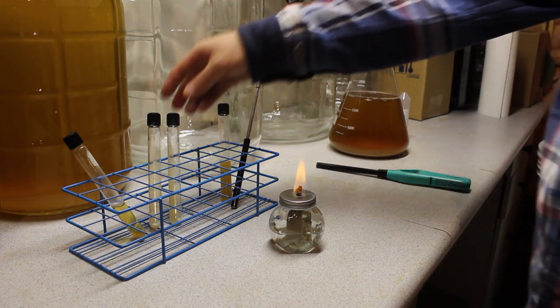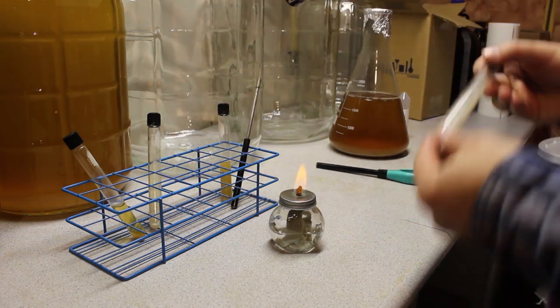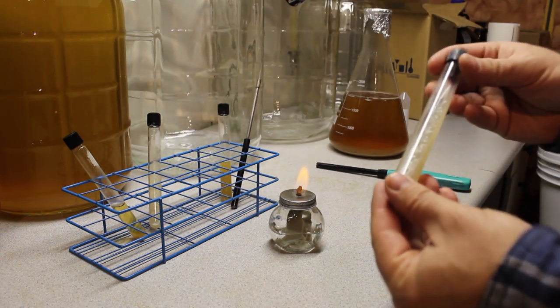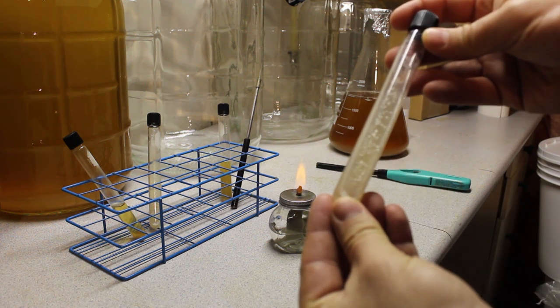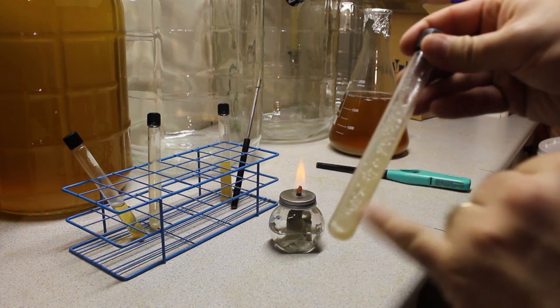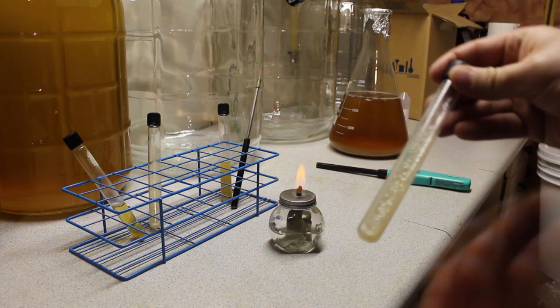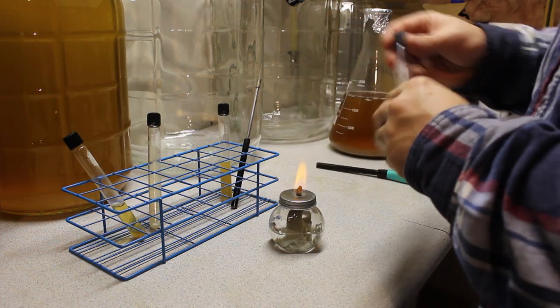So the next thing to do is to transfer from a slant, and this is actually an even easier procedure. And hopefully you can see here in the slant I have a lot of good growth, nice strong growth, which makes this a good slant to take our yeast from.